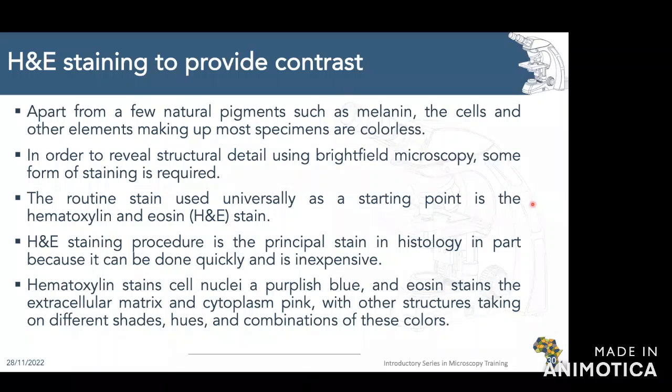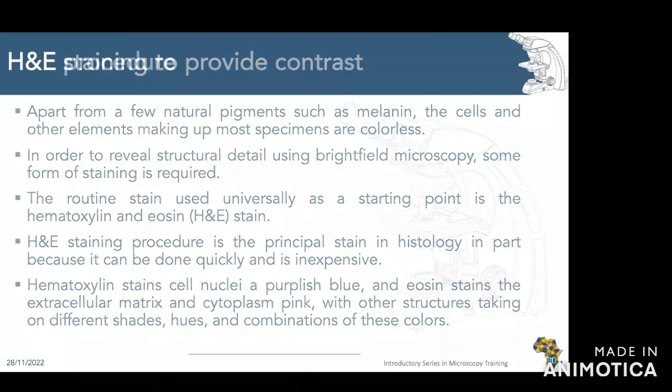So when you're doing differential cell counts, you can identify T cells and macrophages and different immunological cells just based on the shades and hues that they have. So definitely look at examples in the literature, and there are some very nice protocols and manuals so that you can really have a good identification of your different cell types. H&E is really a good stock standard to start with if you're looking at your basic histology.